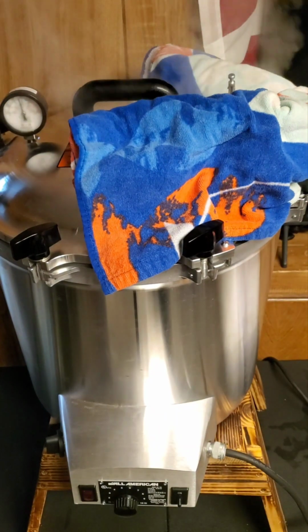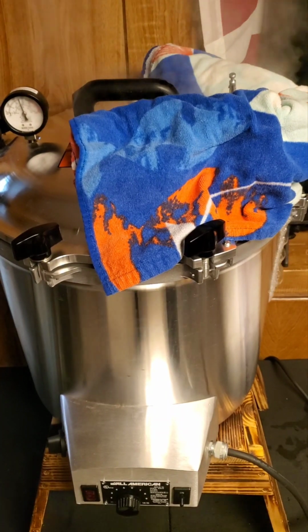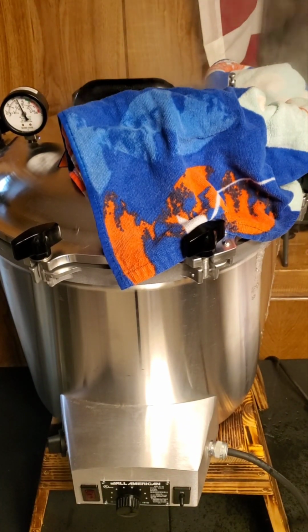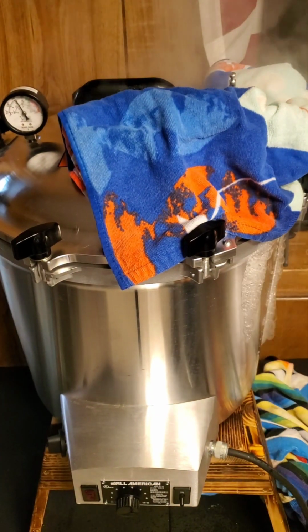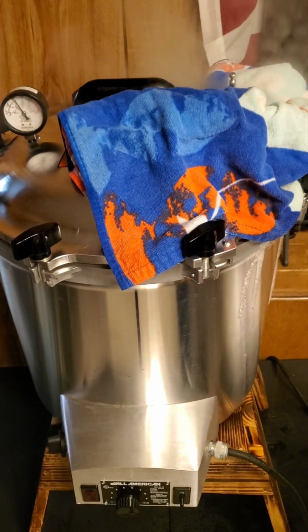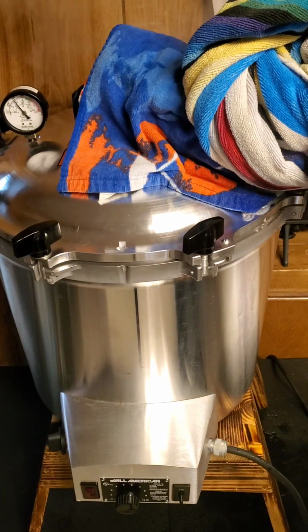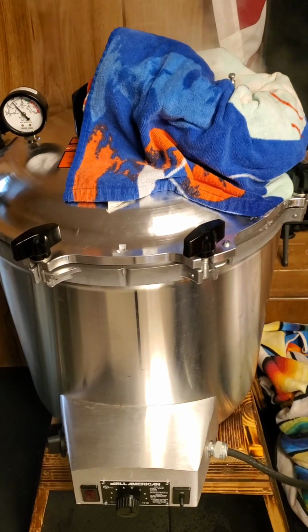de-steam, go all the way down to zero. So I'll let you watch that, so you know what to expect when you're getting there. See the water coming down the side. So we have another towel. That's why I have the other towel handy. Milk up there a little better. Also, why we unplugged everything and turned it off.